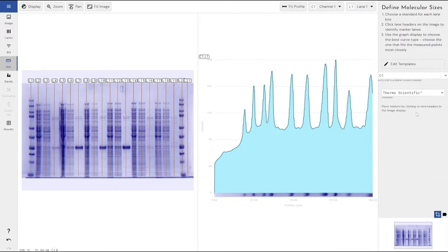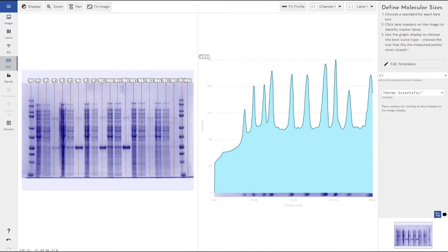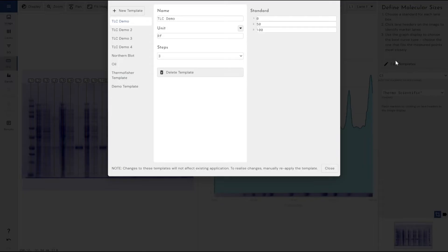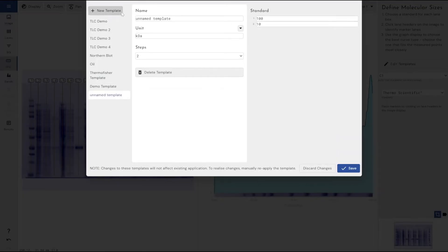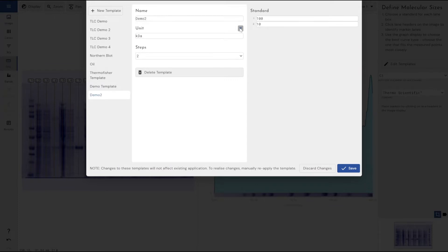If you were using molecular weight ladders that you've developed within your own lab as part of your own SOP, we do also accommodate those as well and give users the ability to create their own templates. To do that, if you come here and click on Edit Templates, you can click on New Template and let's call this Demo 2 as I've already got a demo.